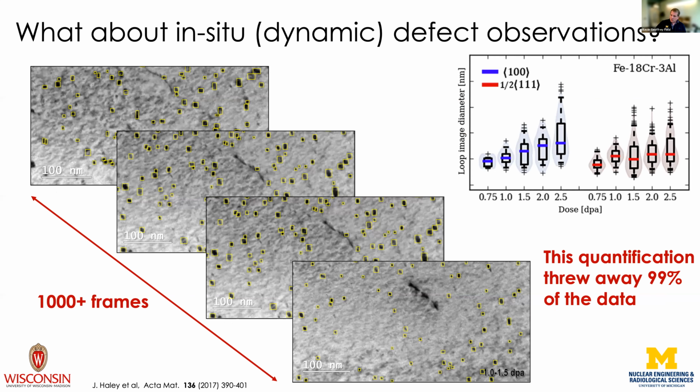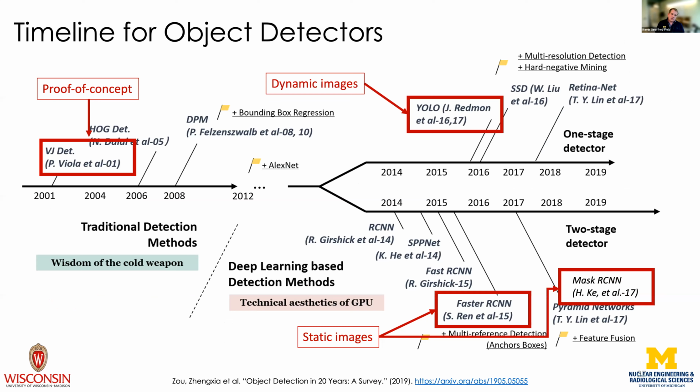So one of the things that my group has been focusing on for the in situ data extensively for the past year or two, and with the University of Wisconsin many years before that, was looking at automated defect detection, right? So I think almost every graduate student who does electron microscopy in detail has thought about making this really great Python program that does Hough transforms and finds those defects. They code on it for 3 months and they realize I could have spent those 3 months and just counted the 5 images I had and been done. And I just wasted 3 months in that process. That's what I did in my grad work, right? That was in 2012. That's when I finished here.